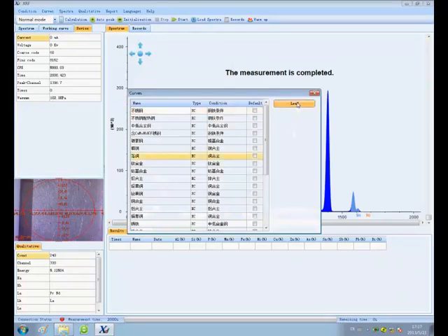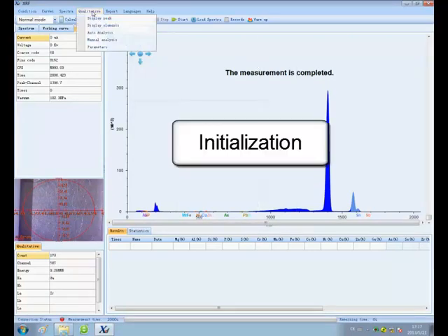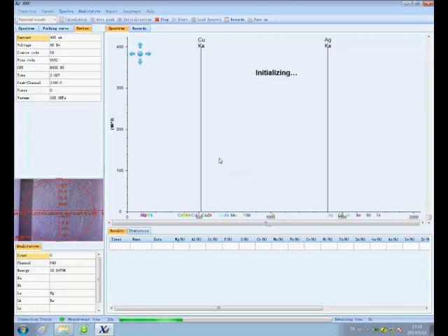After warming up, a message indicating the measurement is completed pops up. After this, choose a working curve and click Initialization. It reminds you to place a silver sample. Click Confirm.